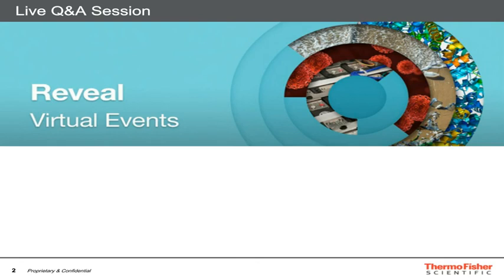Yes, thank you for the question. That is a good one, actually. The software we use to process the data is going to take into account each of the matrix effects and the different absorption coefficients of the different elements in the different layers. And so, yes, matrix effect will occur, but the software is going to take into account each of those effects and, using the fundamental parameters approach, will still provide the correct results.